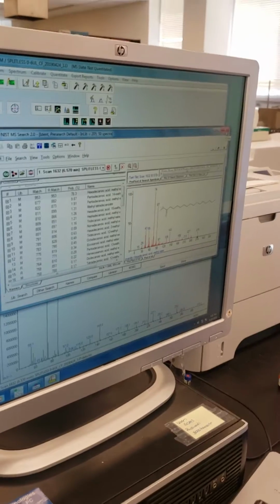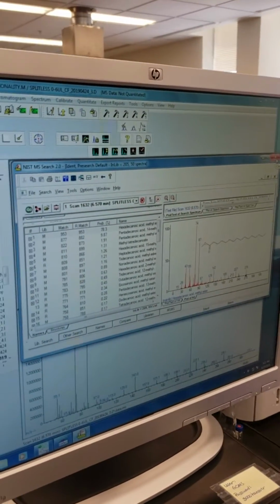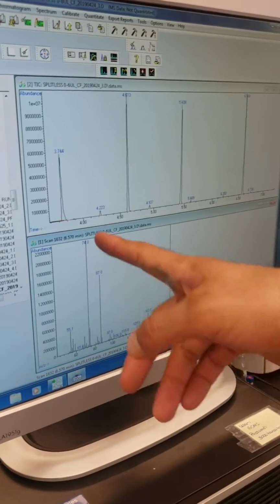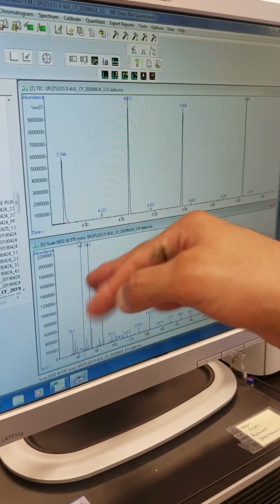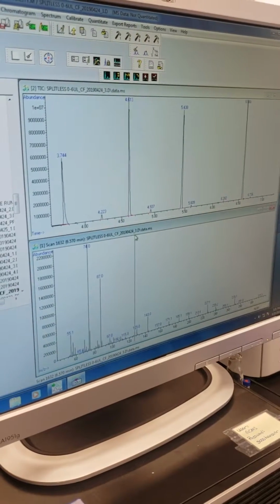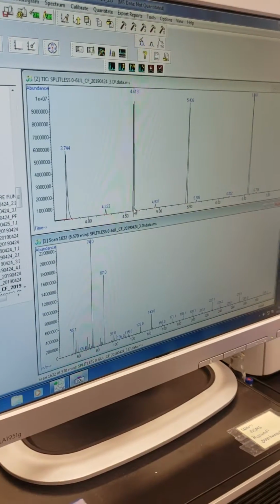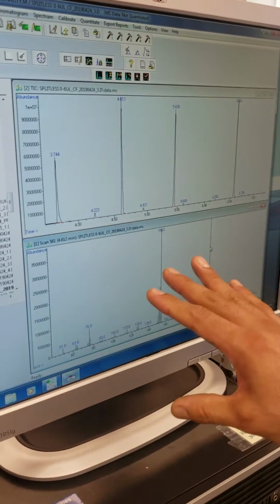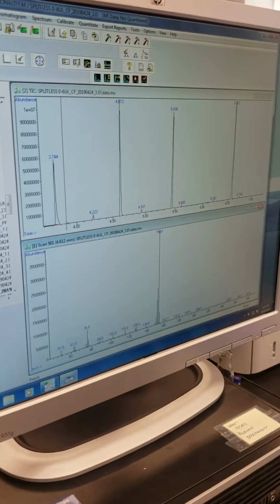If we want to print, suppose this is our compound and we guess this is the peak that belongs to it because it might be the most concentrated or the most abundant. Can we print from here, and will it print the whole thing?